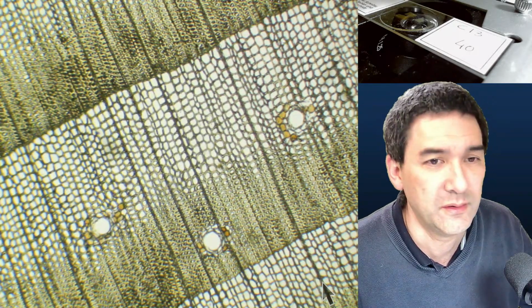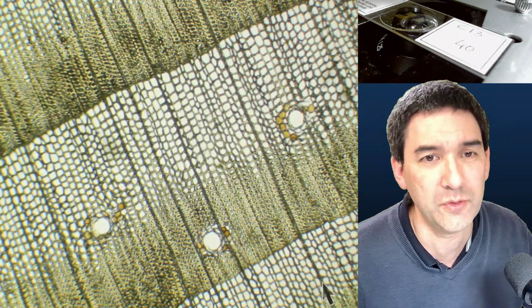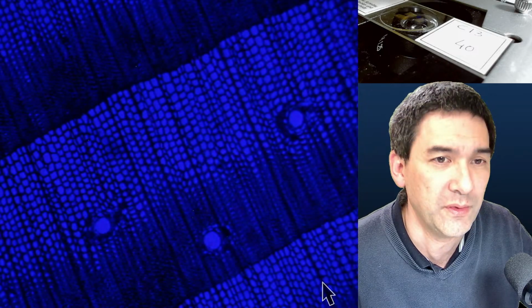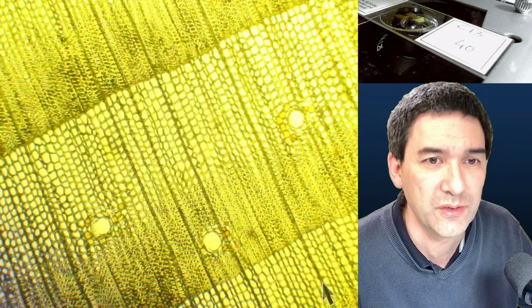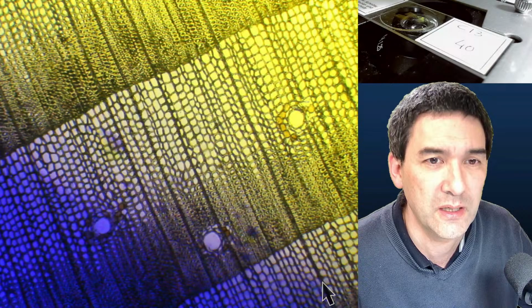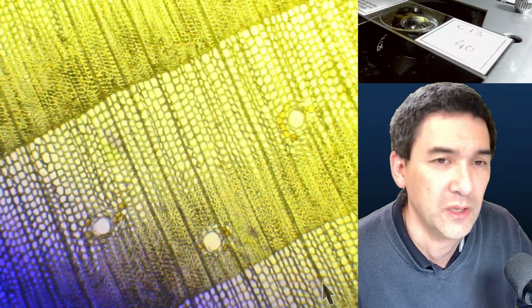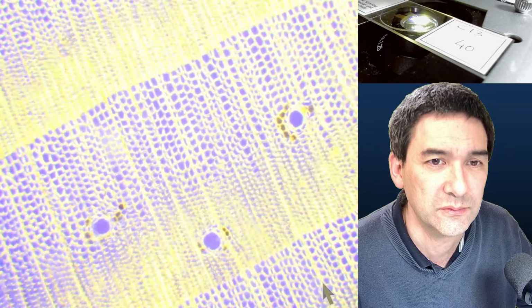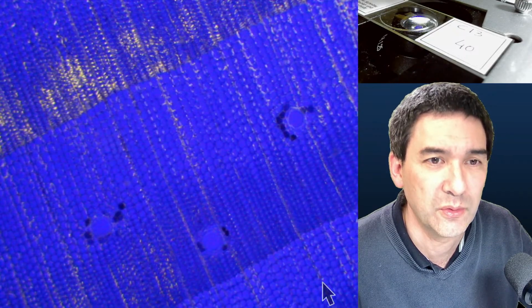What I just want to say is, probably before trying any fancy upgrades, try playing around a little bit with color filters. Of course it doesn't work. I have to open the condenser again, and here we go. Okay, I have to turn down the lamp.